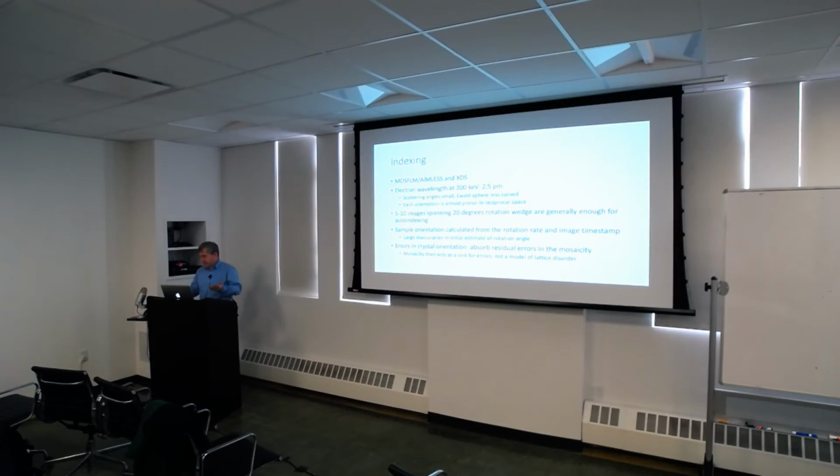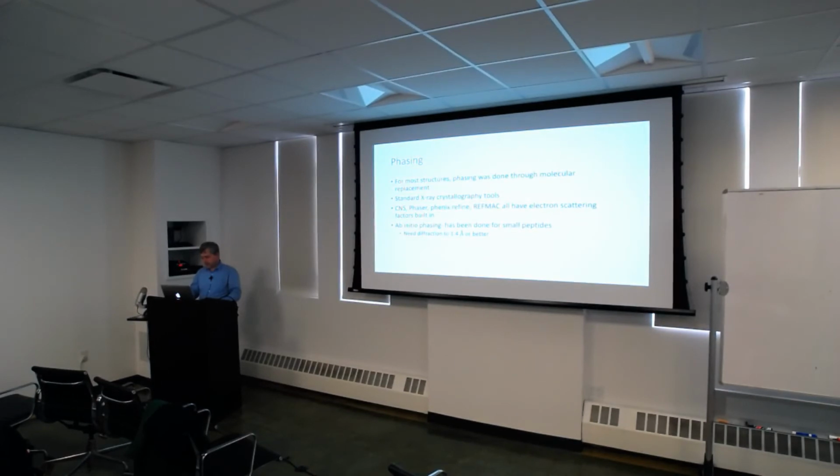It's seldom used, really. I don't think about mosaicity as anything other than a sink. You always use it as a sink for all of the bad values. You want to set the parameter big enough so that it includes everything, basically, because if you have a really elongated diffraction pattern or diffraction spike, you want to include all of that. So maybe that's what matters.